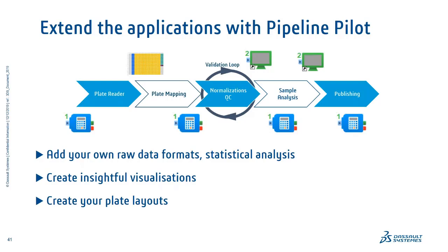Another aspect that can be extended, you don't need Pipeline Pilot for that, is obviously the different plate layouts, for which we provide a nice UI for you to define your own layout, both for the mapping of the plate itself, so the control layout. That's also a way for you to predefine templates for conditions, for example, on your plates.